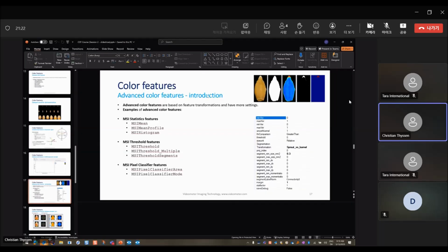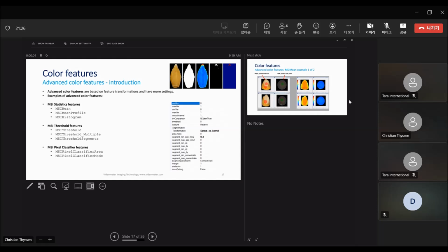There are also some other parameters, such as the one we call smooth kernel. If you want to smoothen your image before, like you apply a filter, you can do that. The threshold comparison method is basically where you pick a threshold and you ask each pixel, is it greater than 0? Then it's put into the foreground. So what happened up here, if you look in the upper right, is that we apply a transformation, and then you get this image here. So here you basically applied a greater than with 0, and then applying the transformation only to this seed. We ask each pixel, is the pixel above 0 or not? And if it's above 0, you see then we get the fourth image over here. So all the pixels that were above 0 are put into the foreground class.